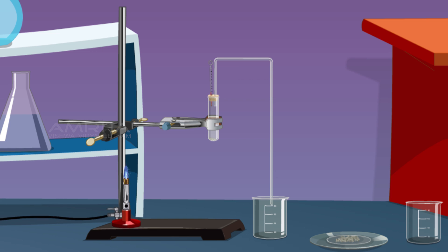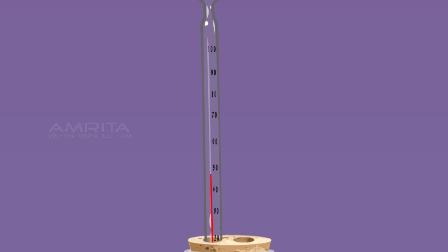Take a Bunsen burner and heat the boiling tube gently by rotating the flame. Note the temperature T1 when the boiling of water starts.